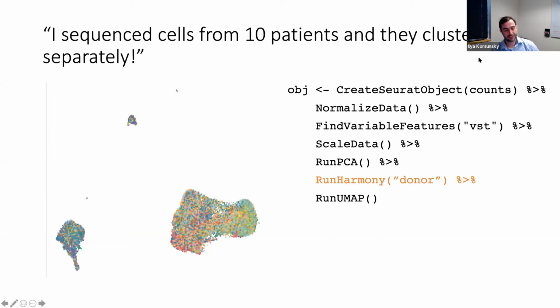Okay. Right. Next question. When we deal with small cell types, they have very small clusters. What is the minimum size per cluster that you consider? I think Harmony is not your bottleneck. Your bottleneck is what you do before Harmony, right? Because you do your normalization, you do your scaling, you do your dimensionality reduction, and if that small cell type is distinguishable in that low dimensional space, Harmony is not going to do anything to remove that cell type, right? So it's really everything before Harmony that I would pay attention to.